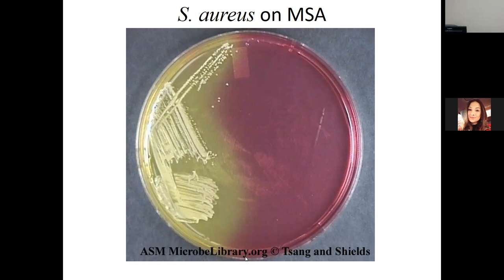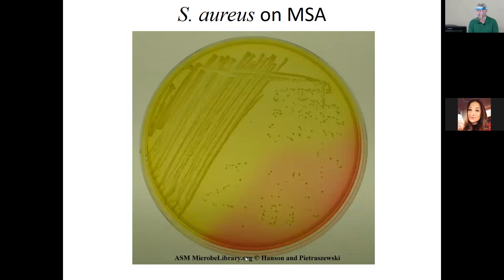I'm assuming that's another reason why lab personnel and nurses butt heads. That's one of the reasons, yeah. You have to realize they do not know how long it takes from the time it was submitted to the time you can finalize it. At best, if it came in one day, it's two days before we report it. The first day is growth overnight, the second day is set up for ID and sensitivity. So the best we can do is a two-day turnaround. Here's Staph aureus again on mannitol salt agar.